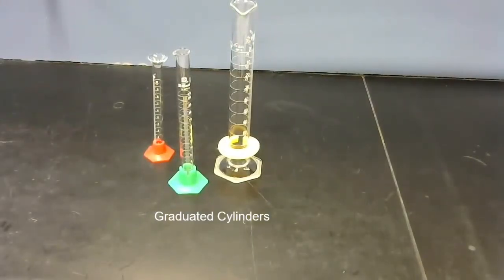These are graduated cylinders. Their precision depends on the markings on the cylinder. You're always going to record one decimal place past where the markings are. For example, if it were marked to the tenths place, you would estimate the hundredths place. If it were the ones place, you would estimate the tenths place.